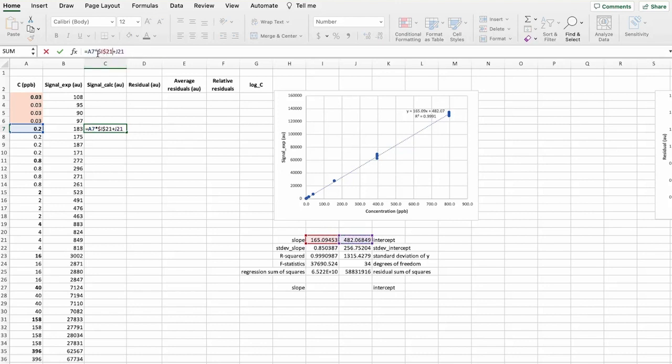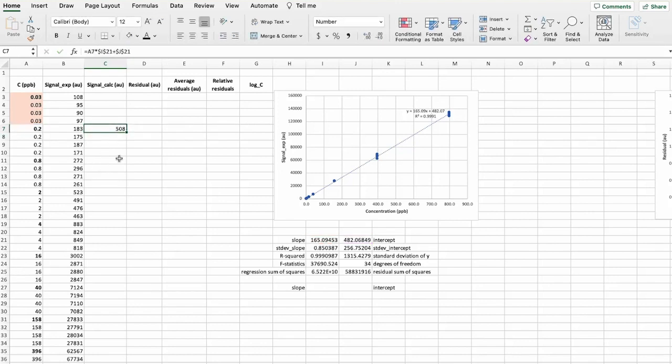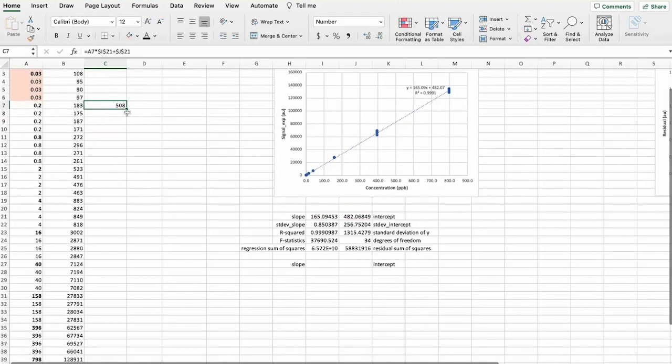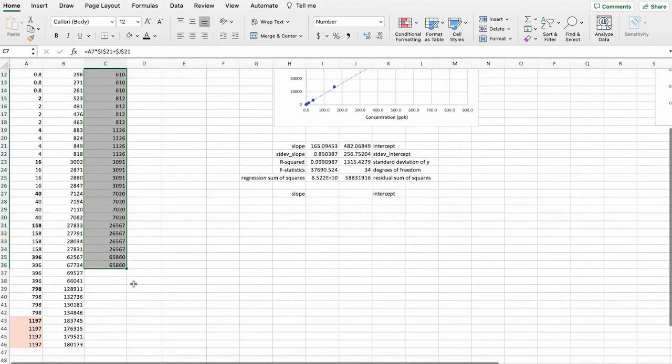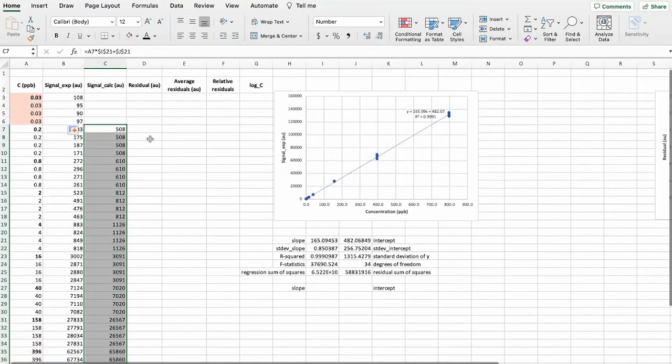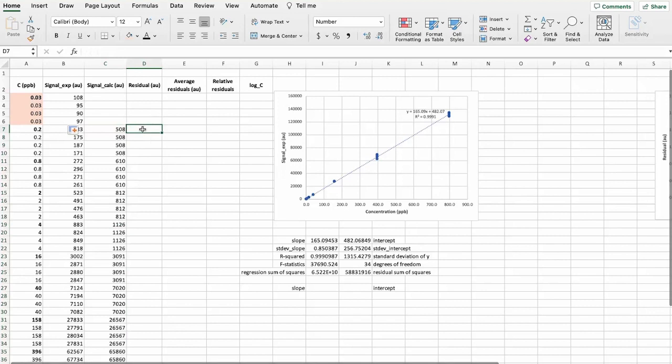So I'll mark them as constants. And let's calculate them for all of the concentrations.